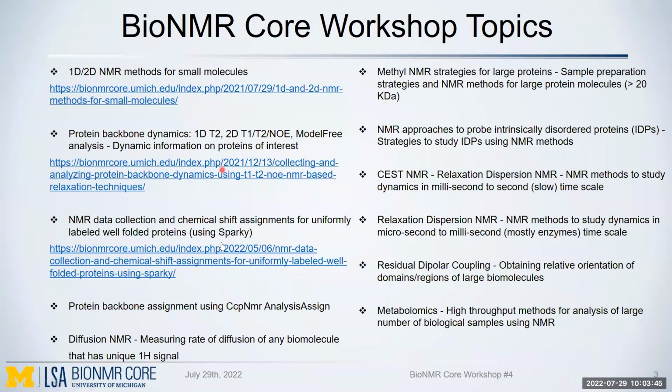So for all those three workshops, the videos are available online and you can watch them anytime. And today is our fourth workshop. And in a few months, we'll hold the fifth workshop on diffusion NMR. And in the future, we will do other workshops quarterly to cover methyl NMR strategies for large proteins, NMR approaches to probe intrinsically disordered proteins, dynamic NMR, relaxation dispersion NMR, residual dipolar coupling, metabolomics, and so on. And if you have any other topics that you are interested in, feel free to contact me or Deb, and we can add that topic to this list.